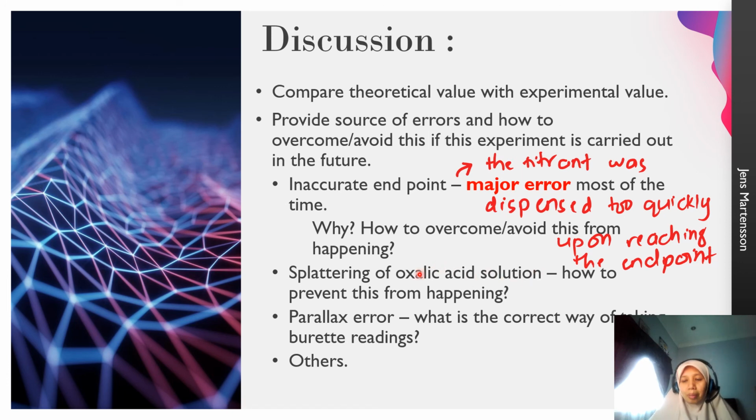Okay, number 2, maybe this is my suggestion. Some of you might stir the oxalic acid quite fast, and that might have splattered the oxalic acid solute. So how to prevent this from happening? Suggestion: you stir slowly and carefully, to avoid splattering.